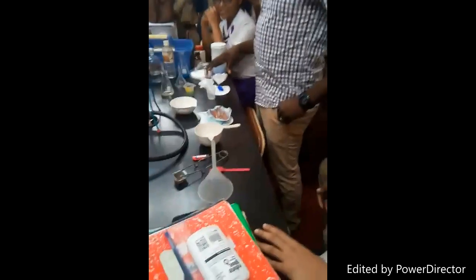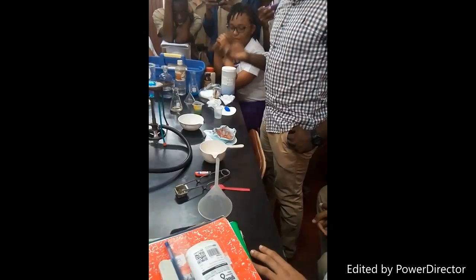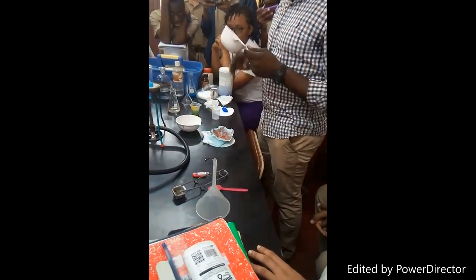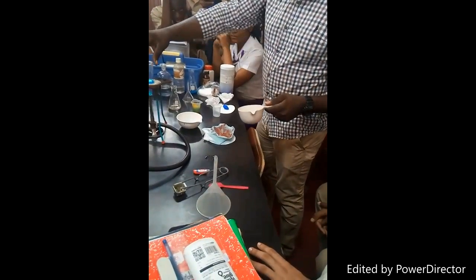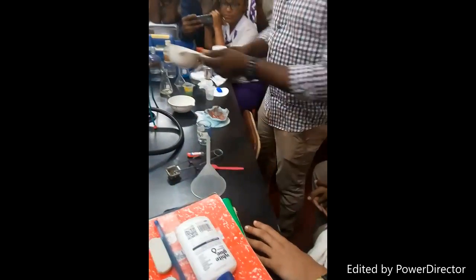Almost. Alright? For us to get it to look like this, we need to not let this boil down to dryness. If we do that, it's not going to look like that. If we let it dry down, it's going to look like this actually. Let's just cook this a little bit.